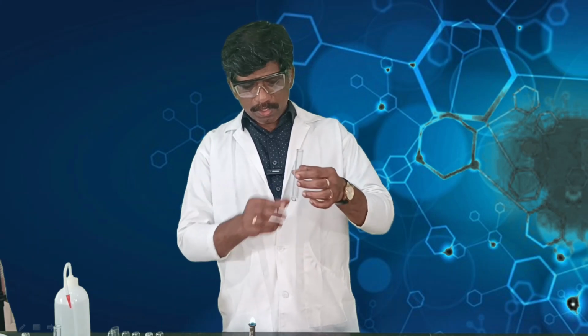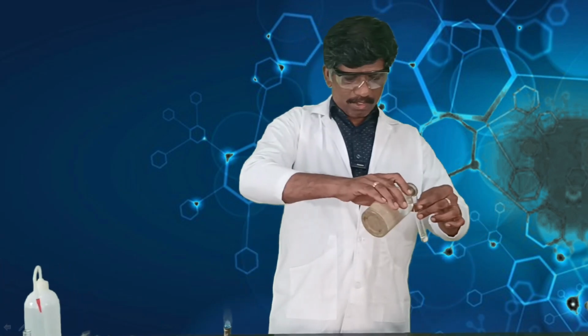Now we shall see the test for aldehyde and ketone. Both aldehyde and ketone give a positive test for Brady's test. In order to do the test, you take a little amount of the substance and add a little alcohol, actually rectified spirit, and dissolve the substance in rectified spirit. And then add Brady's reagent.